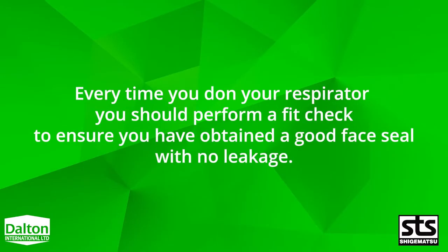Every time you don your respirator, you should perform a fit check to ensure you have obtained a good face seal with no leakage. Today, we're going to demonstrate how to perform a negative and positive pressure fit check with a SDS Shigematsu half mask.